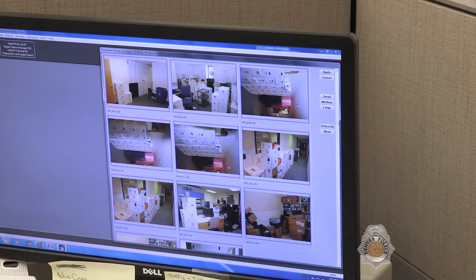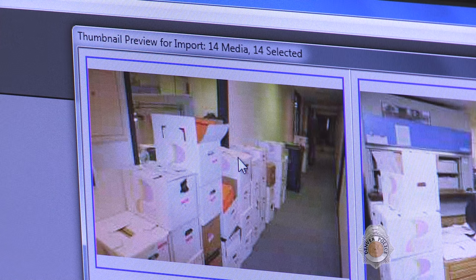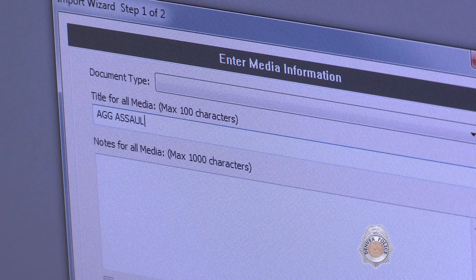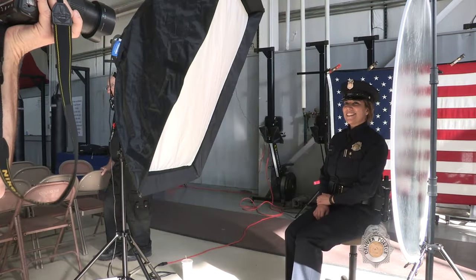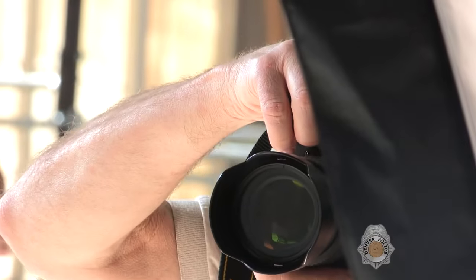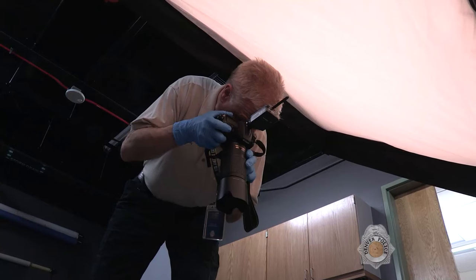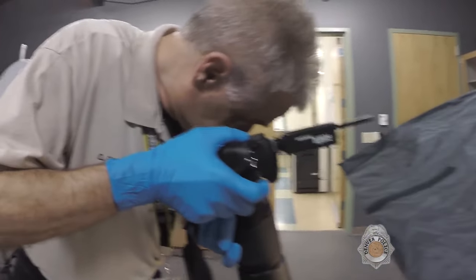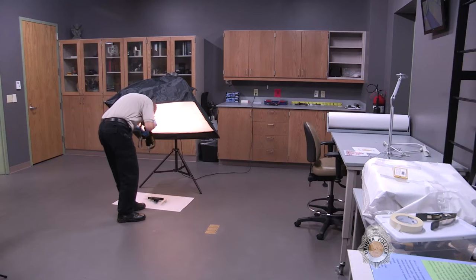The Forensic Imaging Unit is also responsible for securely archiving photographs of evidence from crime scenes, traffic investigations, and other crime lab units. These images are sent to a secure server, then retrieved as needed for detective case filings or trial. The unit photographs DPD personnel, as well as victims, suspects, and property items for use as evidence, and performs other specialized photography as needed by investigators. They help train other units to photograph evidence, and also train sexual assault nurse examiners throughout the city of Denver.